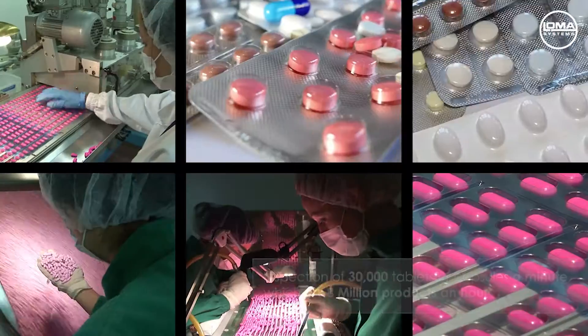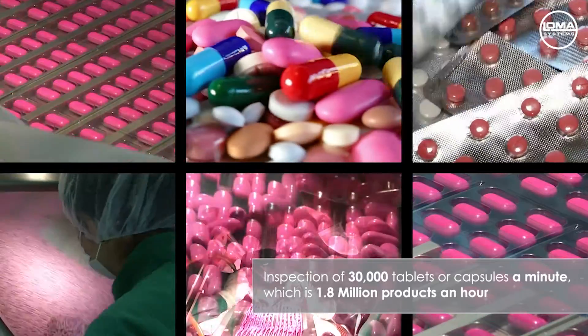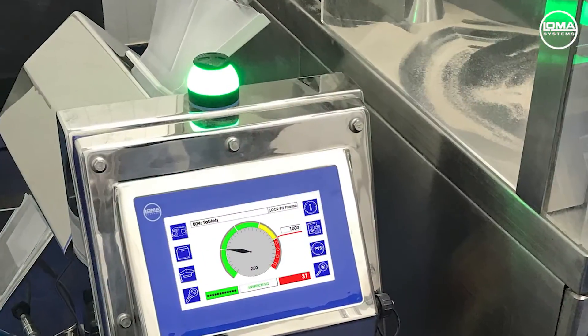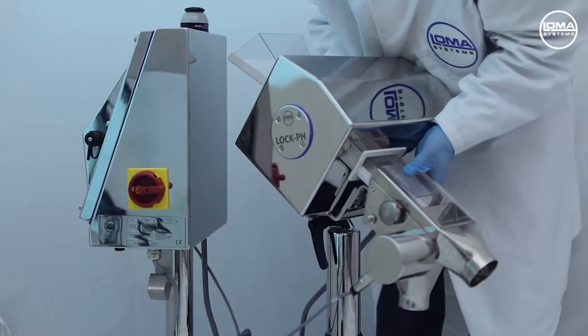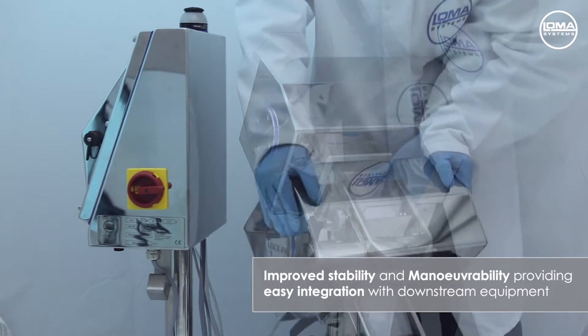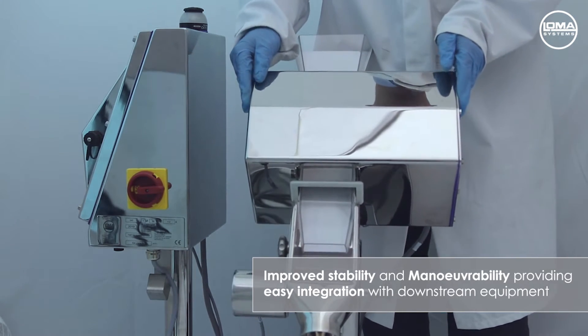The LOCPH IQ4 is capable of inspecting 30,000 tablets or capsules a minute, which is 1.8 million products an hour. Typically installed after the press or de-dusting process, the system's improved stability and manoeuvrability ensures easy integration with any downstream equipment. Additionally, the unit can send a volt-free signal or a pulse to stop such machines.